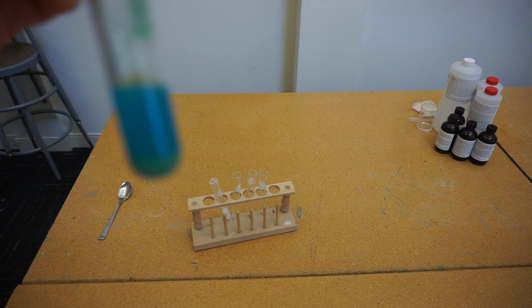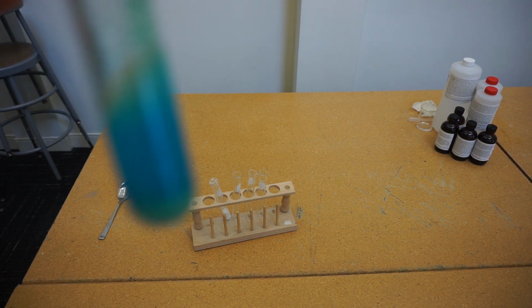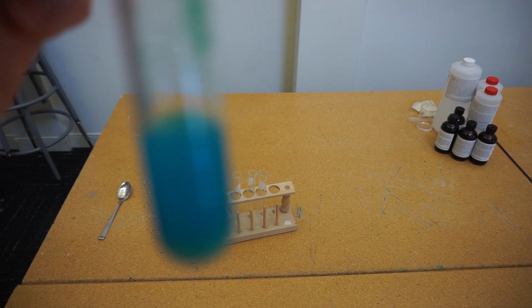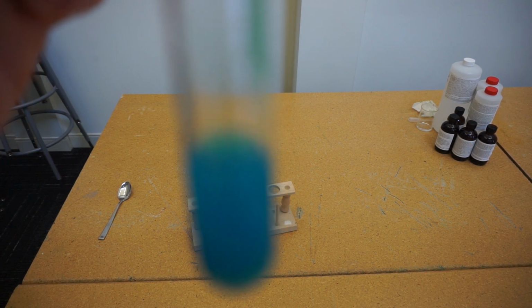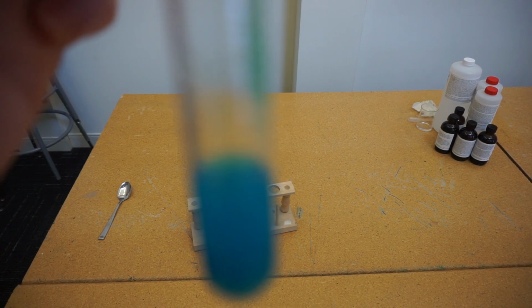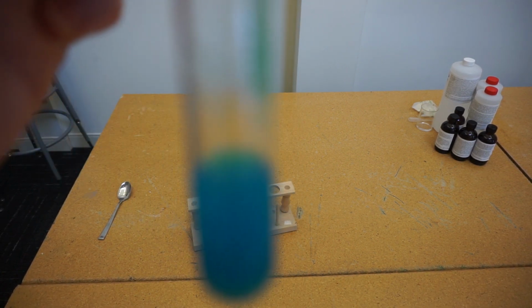For our third reaction, so again we've now got our copper sulfate solution that we've just produced from the copper carbonate and the sulfuric acid. I'm going to react that with sodium hydroxide. So again, I'd like you to think about what sort of reaction this is, and it should fairly obviously give us our third piece of evidence that a reaction has taken place.